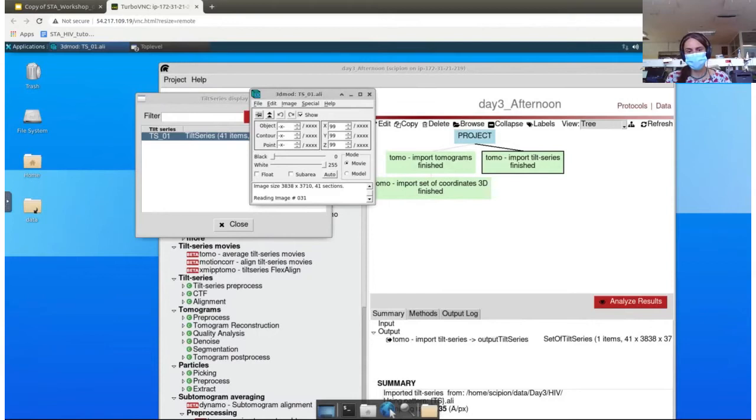This time, Bram, we use for the computation of the tomogram the SIRT method from the Jose Jesus program, Tomo3D. The SIRT in this program has a better quality of the final reconstructed tomogram. So that's why we use that one.